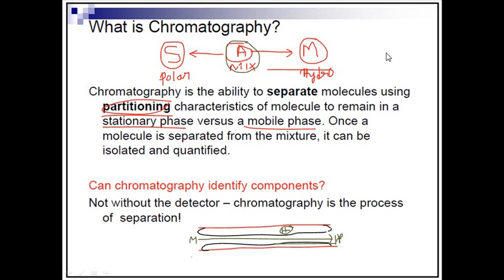So we need to have a chamber through which we can add these analyte molecules. It is called the injection chamber. Through this injection chamber we add analyte molecules, and using the force created by the mobile phase molecules, we travel these analyte molecules from one direction to another, according to the flow.